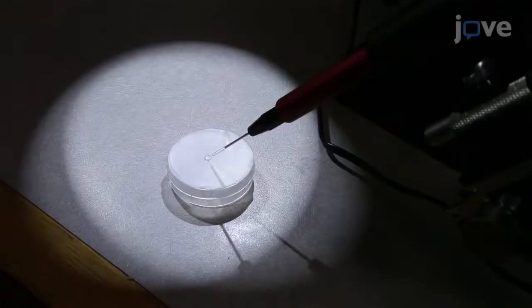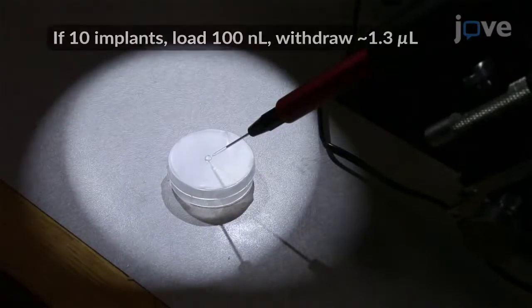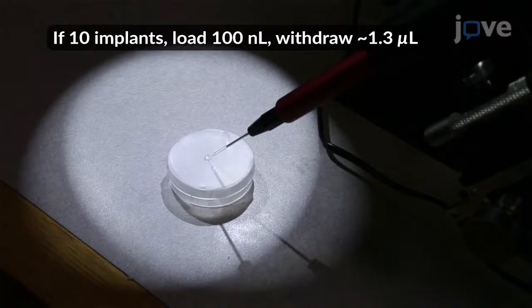To deposit the silk AAV, load an injection pipette with the amount of solution required for the number of fiber implants being made, plus approximately 30% extra to accommodate losses due to pipette clogging.